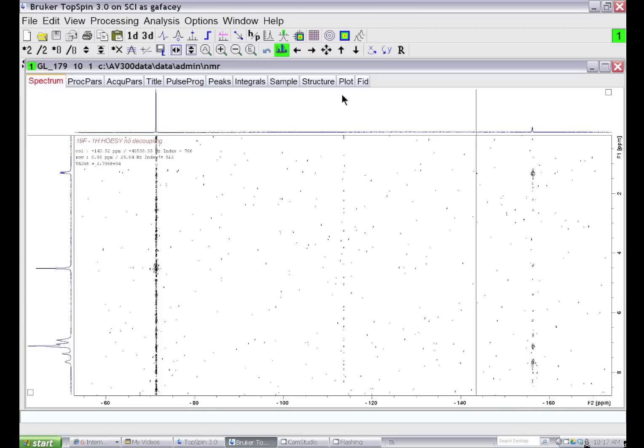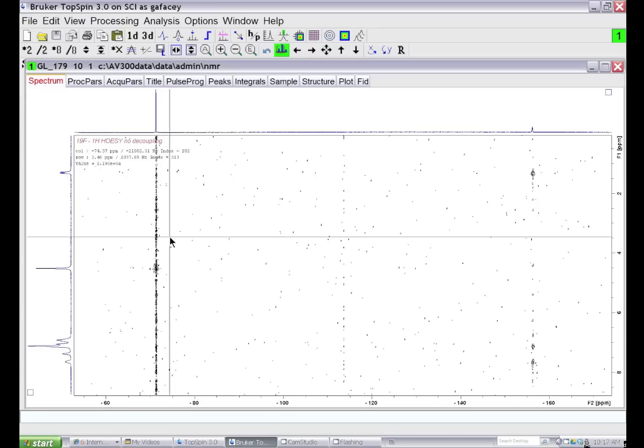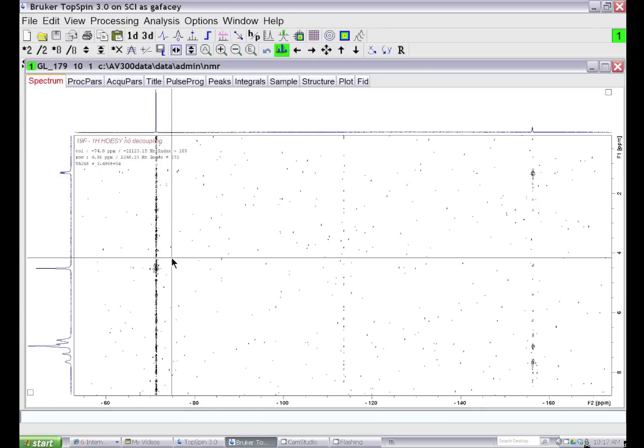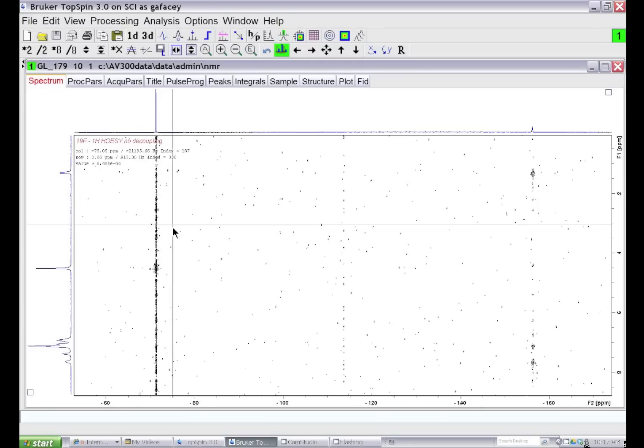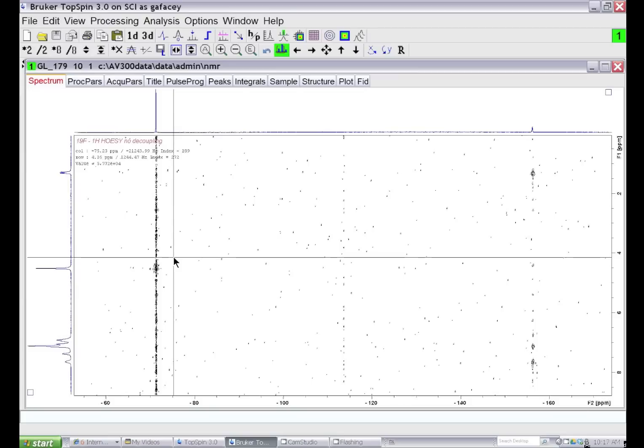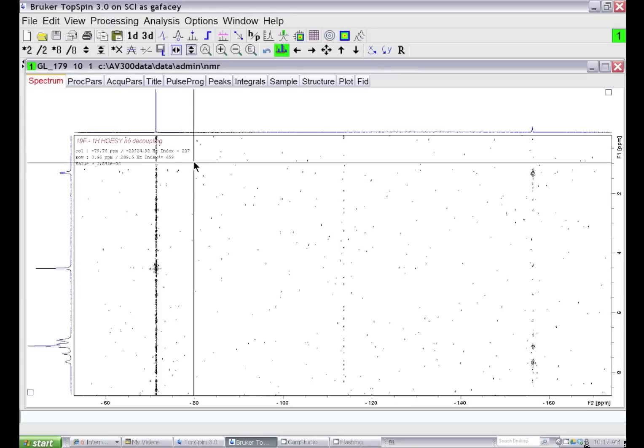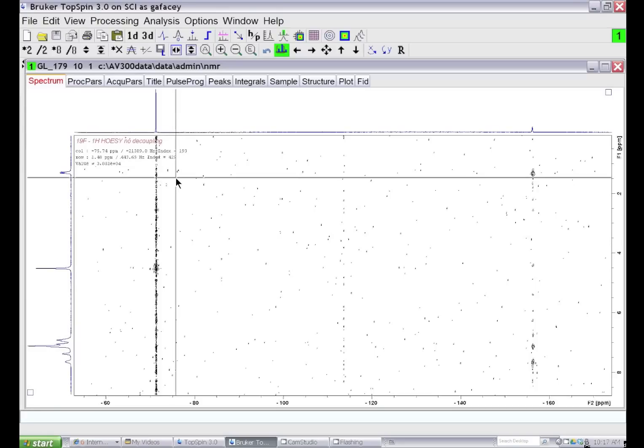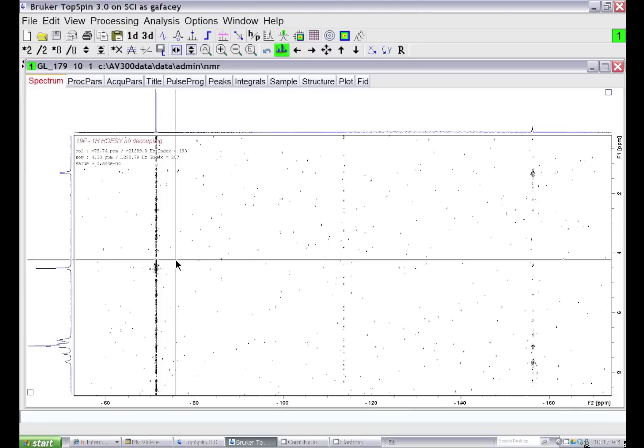The first thing we're going to do is look at the F1 domain of the spectrum and choose a region where there are no signals but only noise. This region where I'm moving the cursor - we can look at the row numbers associated with the limits. This is approximately row number 420, and down here is row number 270.